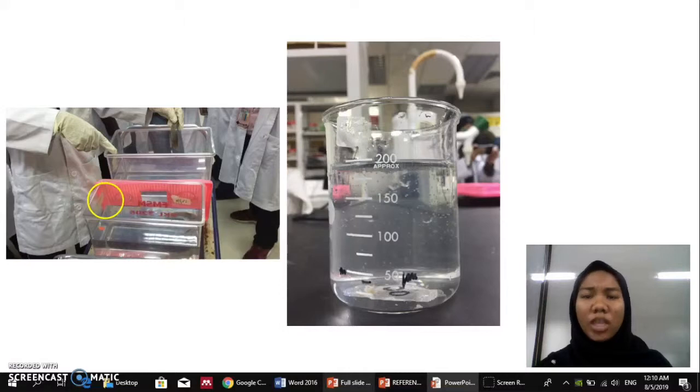So the fish will be transferred into this tank for them to spawn, and as we can see here, the tiny clear dots are the eggs of the fish after the spawning and after they fertilize. The clear ones are the ones that we will take, and the black ones that are denser, we don't take, as they are not in good form.